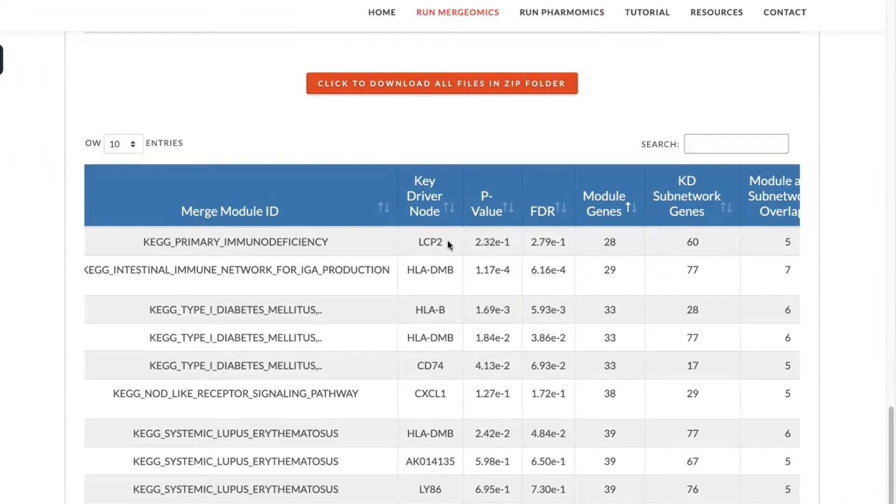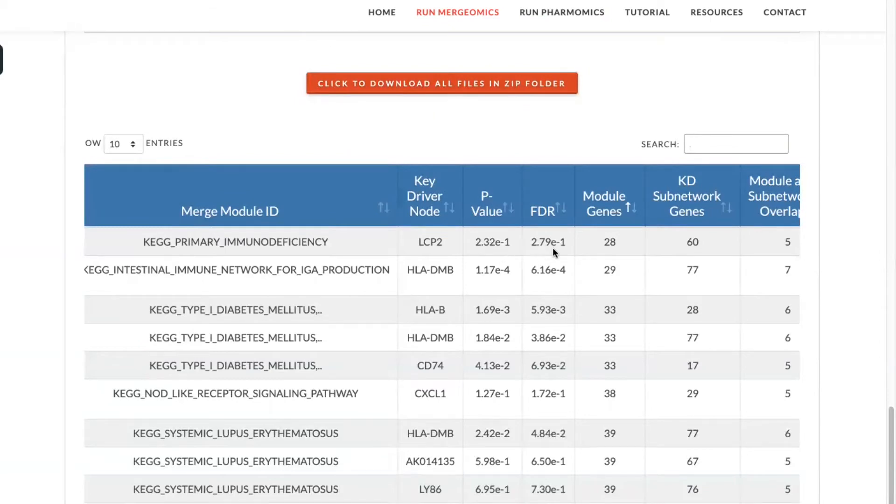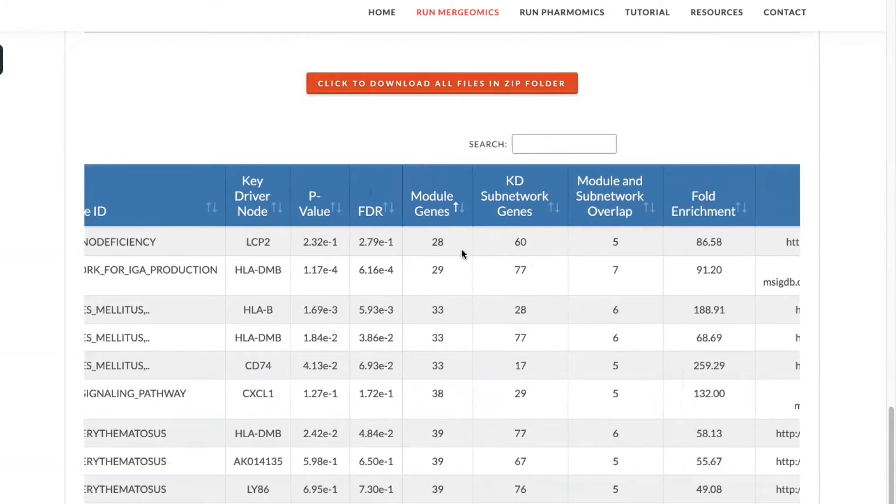You can also see the pathway that that key driver is associated with, the p-value of that key driver, and the FDR of that key driver.